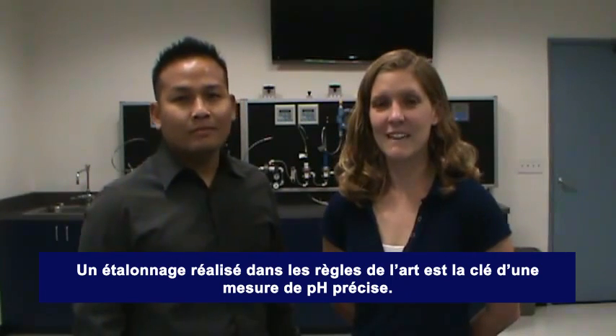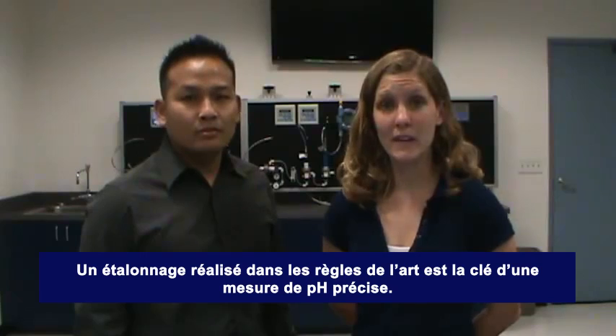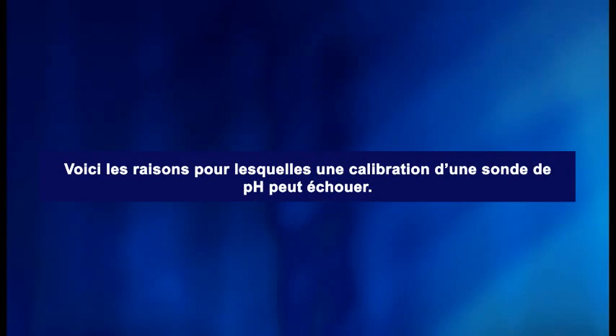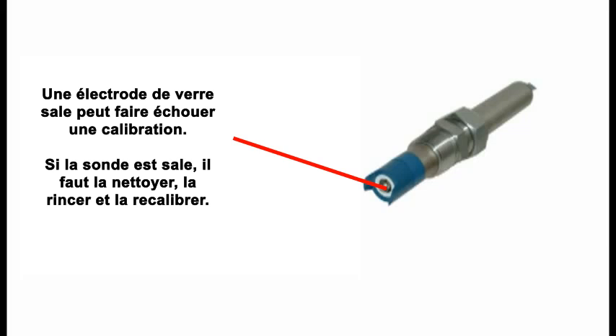If the calibration was unsuccessful, the sensor may need to be recalibrated or replaced. There are a few reasons why a pH sensor will not calibrate, causing the instrument to show an error message. Reason 1: The pH-sensitive glass is dirty. Cleaning the pH sensor may resolve the problem. In this case, clean, rinse, and recalibrate the sensor.